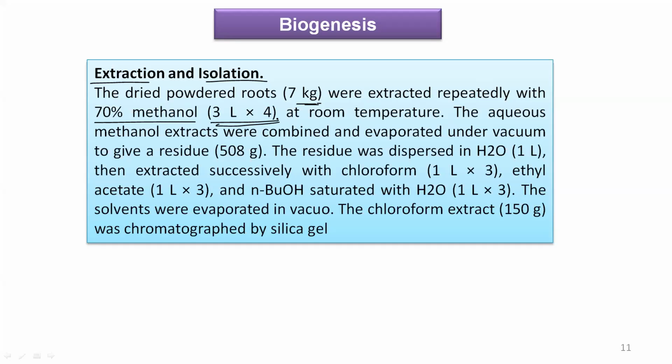3 liters, 4 times. Here repeatedly means पुन्हा केलेलं आहे. 3 लिटर मिथॅनॉल मध्ये याचं एक्सट्रॅक्शन केलेलं आहे, आणि किती वेळा केलेलं आहे? 4 टाइम्स केलेलं, at room temperature.